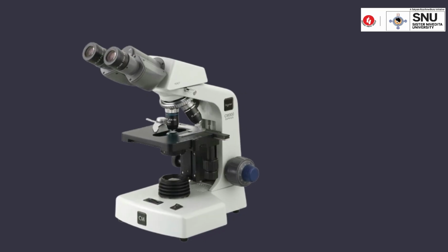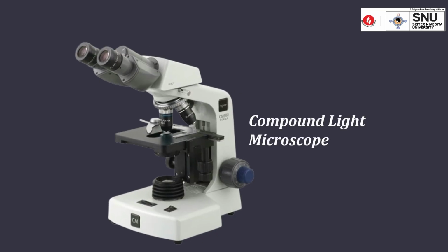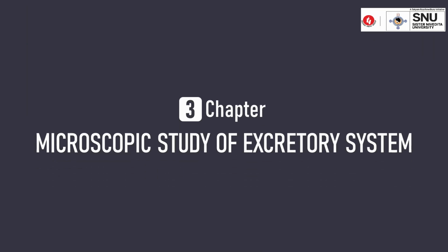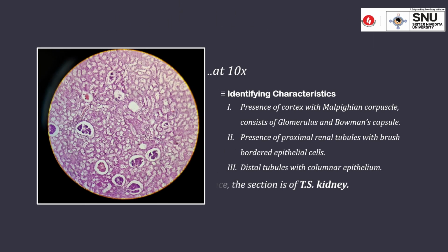With our microscope ready, let's together unlock the microscopic gateway to the fascinating world of human tissues and cells through the examination of prepared histological slides. So our journey begins with the histological slide of the kidney. It is being observed under 10x magnification.